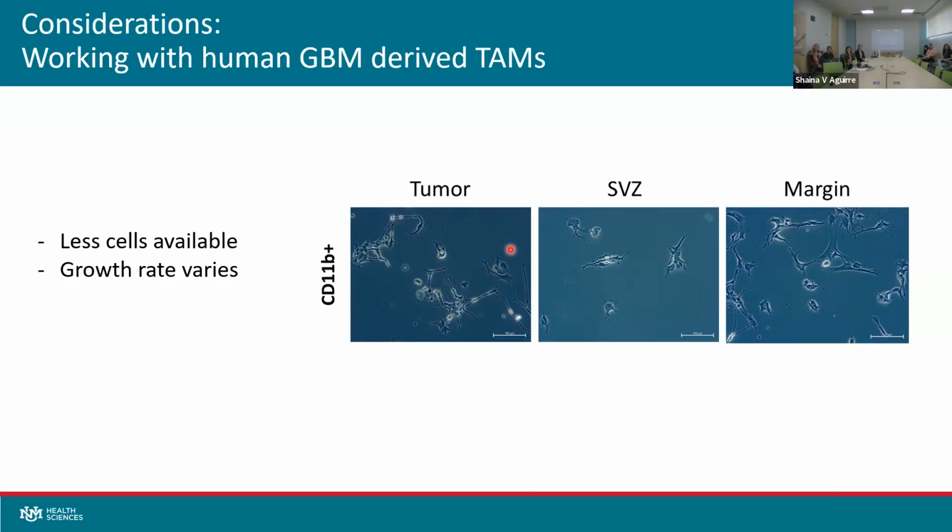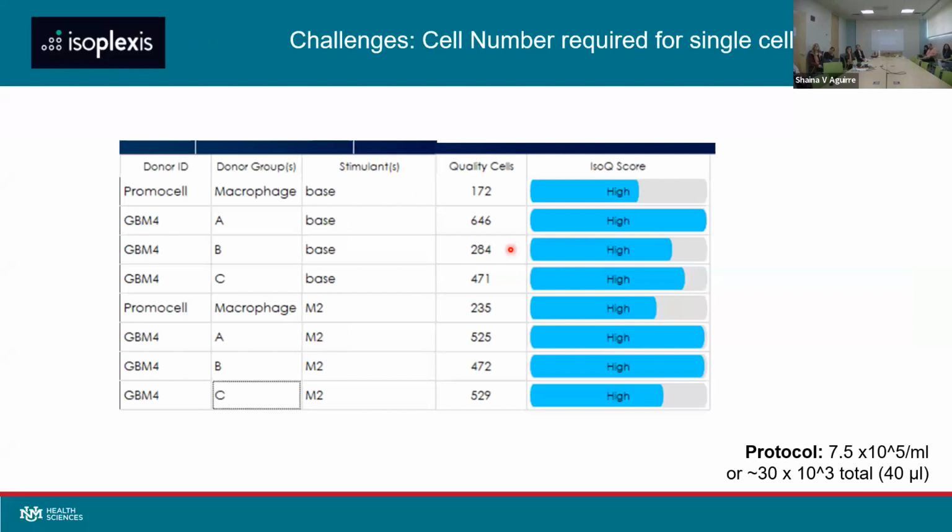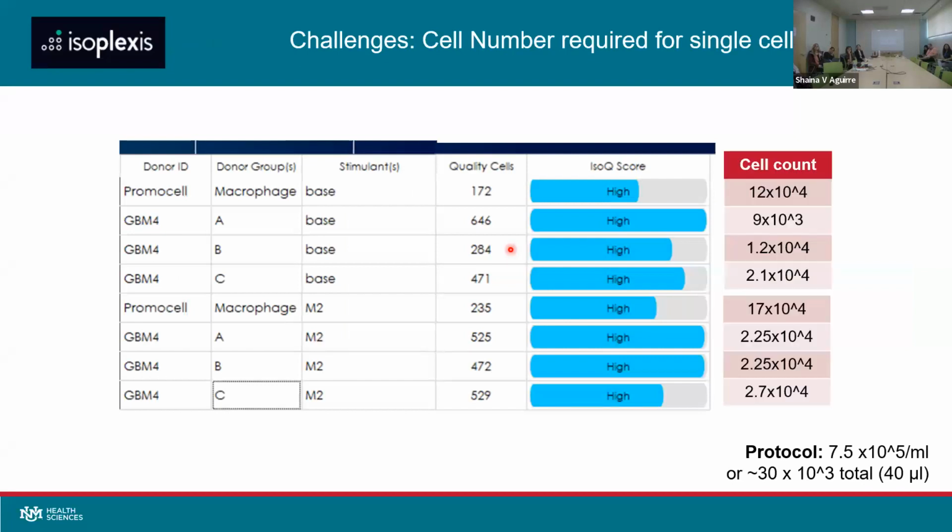The company is going to sell the cells in part because these cells are very hard to grow, but also because they take a long time to recover after thawing them. It was hard to use them, and sometimes you start with a certain number of cells, but at the end of the process, they don't survive. So I was able to use fewer cells and get decent results.